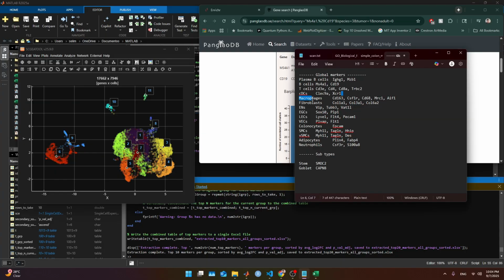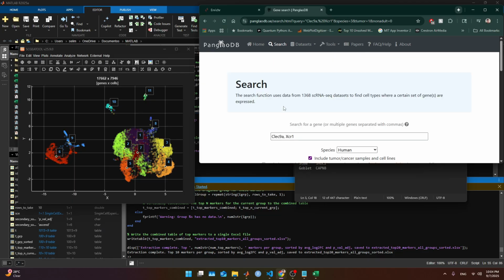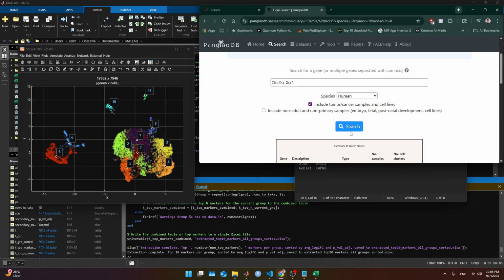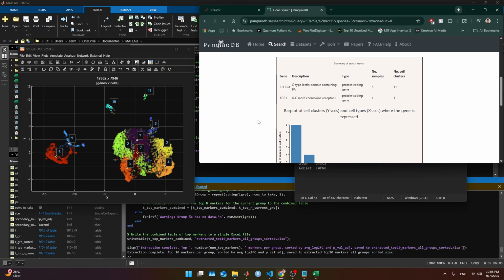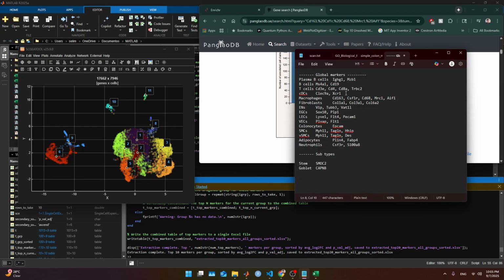And if we look for classical dendritic cell markers, I think those are also good markers for dendritic cells. Yeah. And since we use those, let's look for colon tissue, not here. Very few. But again, if we verify our marker set here, it's gonna tell us whether it's already good or not. This one tells us it is dendritic, but I know those are macrophages. And the dendritic cells can be separated further with these classical dendritic cell markers.